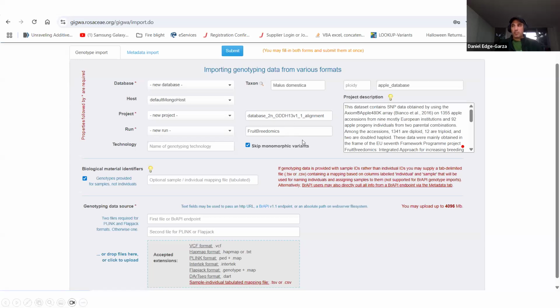And then you'll start to see a percentage going up from 0 to 100, showing that all your variants or your markers are being processed and uploaded to the database. Once that's completed, then your database is ready. This is a pretty quick process. We're usually able to process, well, like 320,000 markers in about 5 minutes on a university system. So that was pretty quick. And so that's that process.